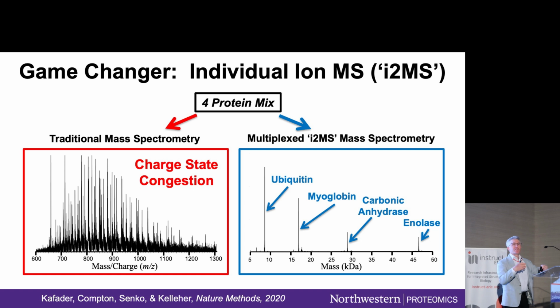When you electrospray a protein into the gas phase, it of course adopts many protonation sites. At pH 3, typically you're going to protonate lysines, arginines, and histidines, and if you have 4 proteins, they all have overlapping charge states. You can deal with that, okay? Sure, you can, and you can deconvolute and generate masses of those 4 proteins. But as soon as you start to get 40 proteins or 400 proteoforms in a single mixture, you can no longer do that. Or to go to very large mass complexes, like 2-4 megadalton complexes.